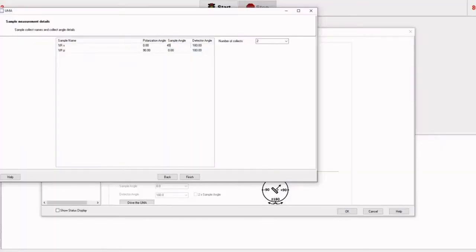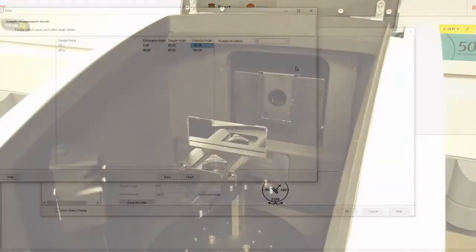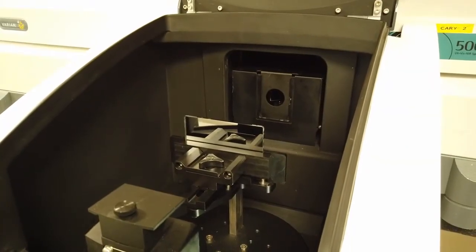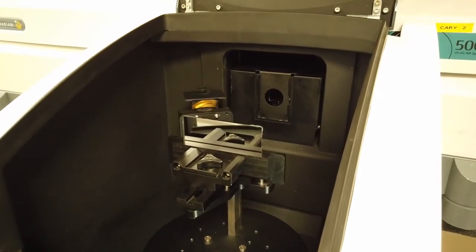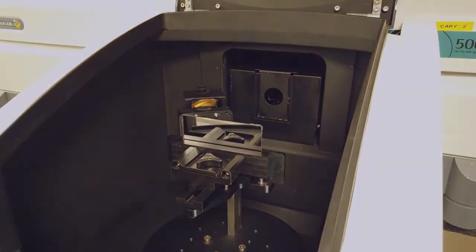With the powerful software, we can input the desired angle of incidence at which we want the mirror to be measured. The detector can rotate 360 degrees about the sample and can be positioned in the required location for transmitted or reflected light capture.